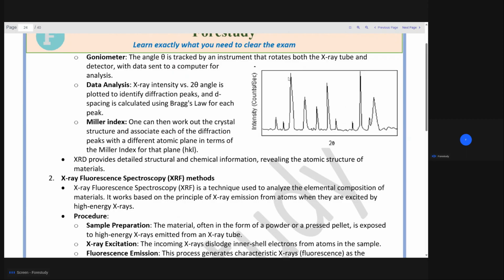So this peak has some intensity value. With the help of that, at a certain 2 theta where this value occurs, it means this type of mineral or this type of element is present. Now, how do we identify what number denotes what type of mineral? We have a standard book called ICDD, a standard reference database. I'll write it for you.